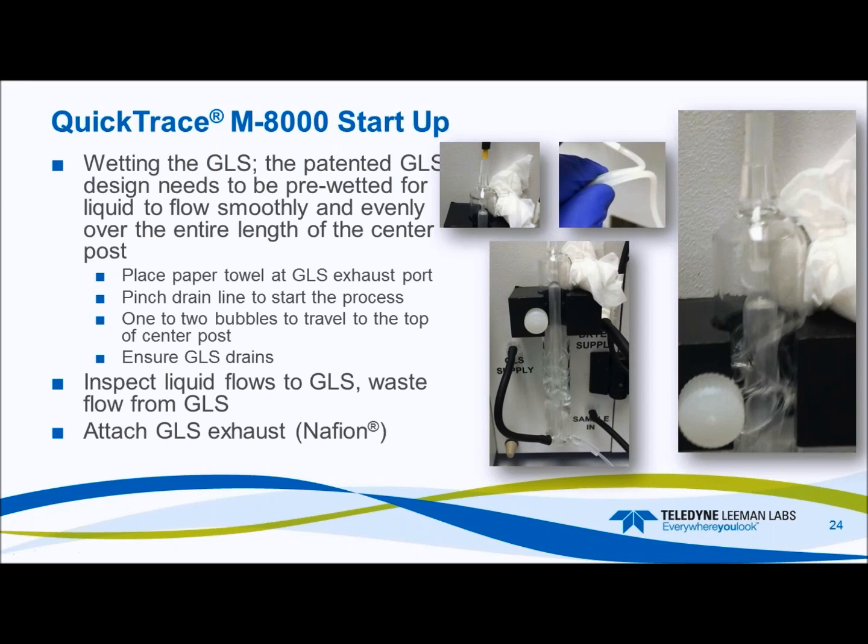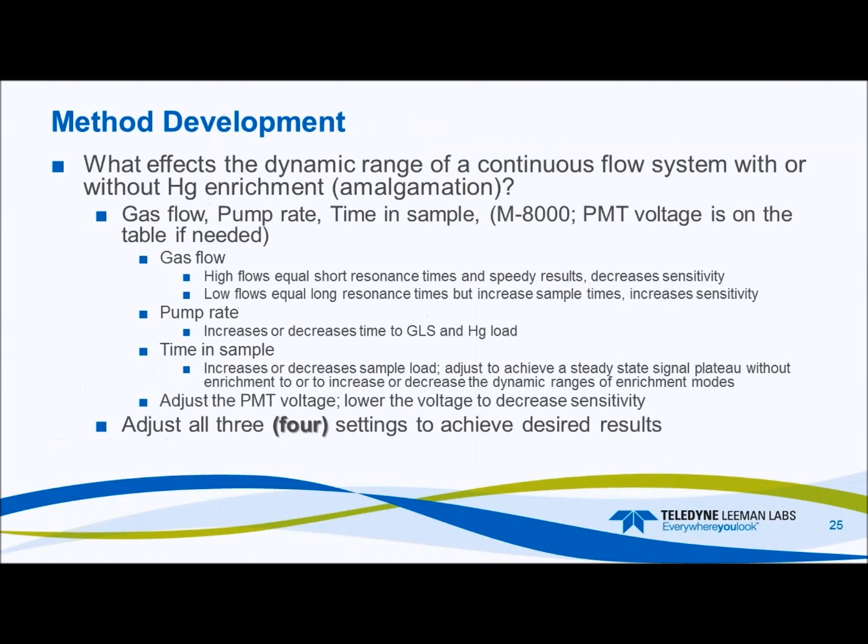Release the drain line, allow it to drain out, inspect your flows to the GLS and then from the GLS, and then you attach your GLS exhaust, which is actually to the Nafion, and then you're ready to roll. So now let's get into the method development.